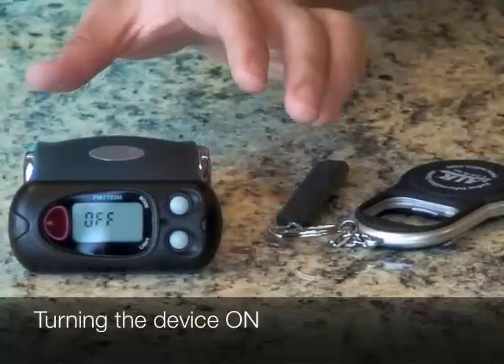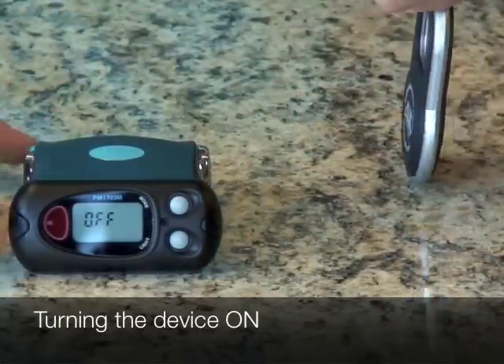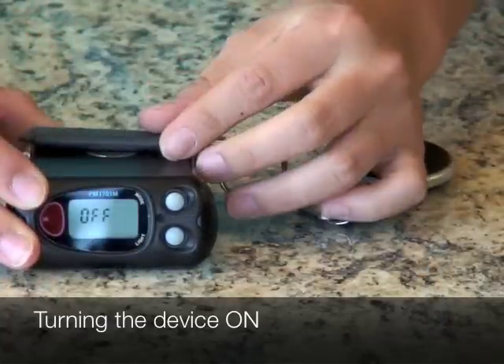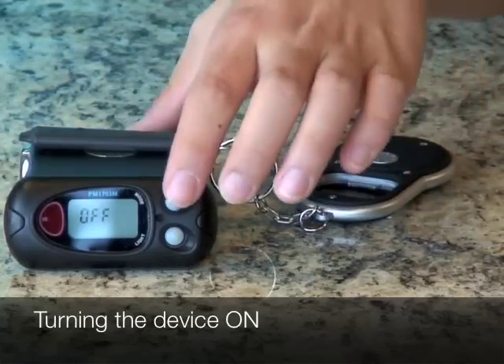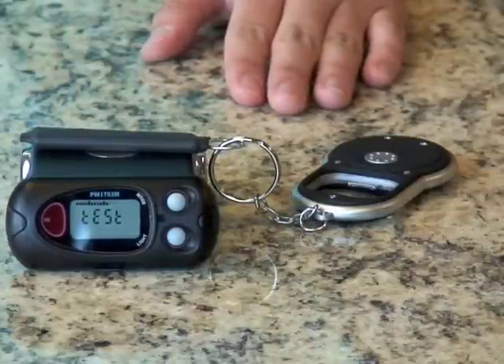When you receive your device, it's going to be off. Before you turn it on, take the check source and place it on top of the silver dot on top of your device. Then turn it on by pressing the mode button for two seconds to enter test mode.